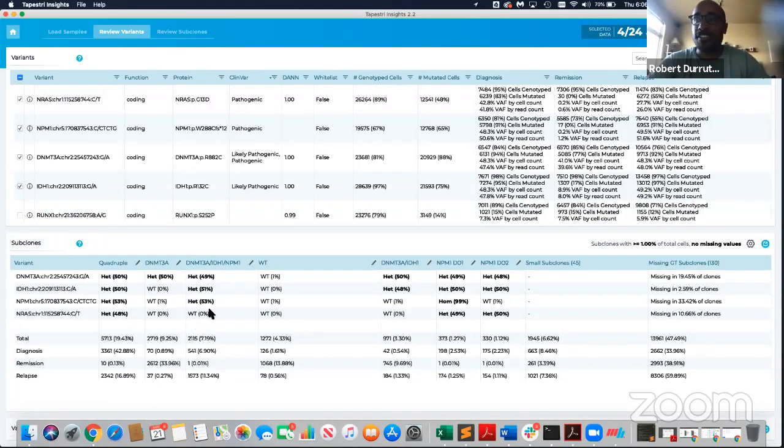But the fact that we don't deem that as a potential dropout is, number one, the fractions are very high, and number two, the counterpart, the homozygous clone at NRAS, is missing, and it's not above 1%. We feel more comfortable about this being actually two dropouts because, again, the fractions are relatively comparable. But yeah, it's a very good question, and it is more challenging to identify one of the pairs. But again, we can help you with that on an ad hoc basis.